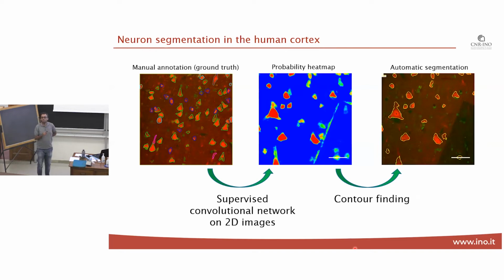optionally placing them in different classes, if you like. In this case, for example, the axon was placed in a different class, so the network should learn to segment just the cellular body and not the axon, which is what we wanted to do.